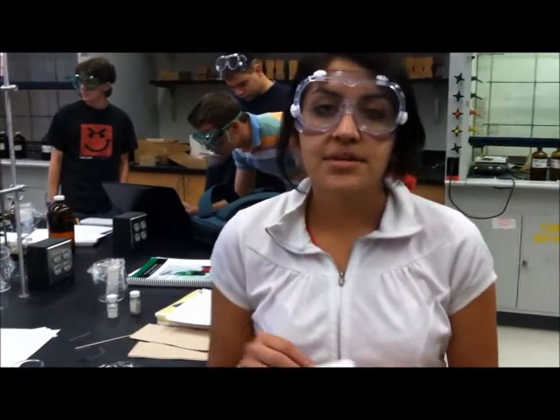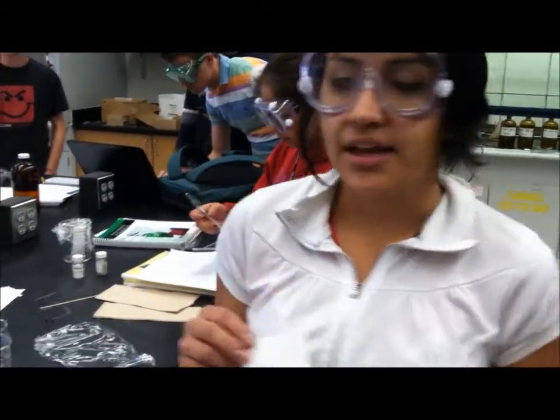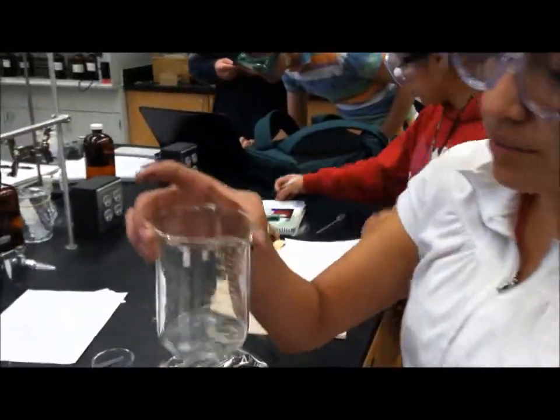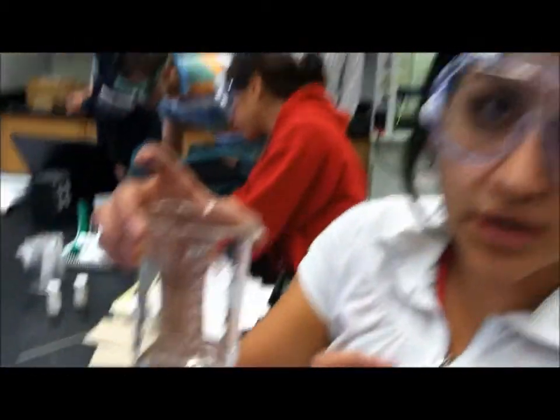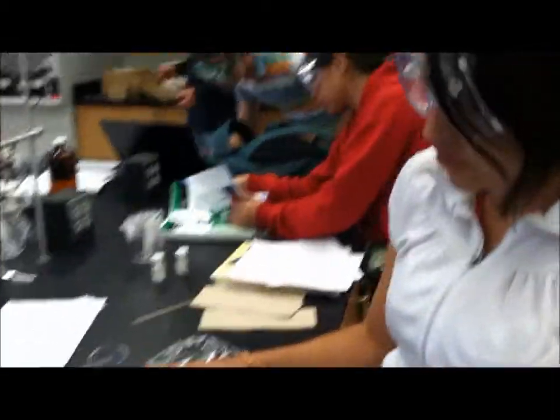All right, after completing the spotting on your paper plate, you want to grab a beaker and place a small amount of water-acetone inside the beaker. Make sure the water-acetone is less than the centimeter line on the paper plate.